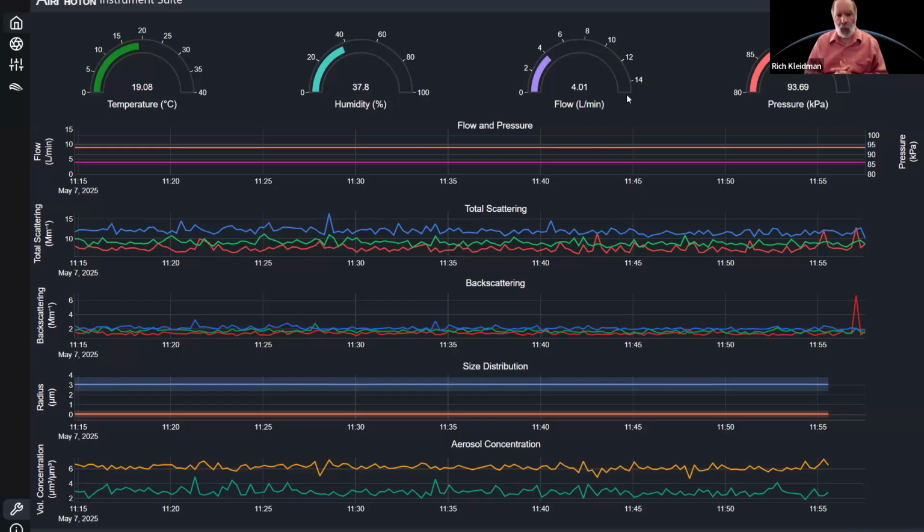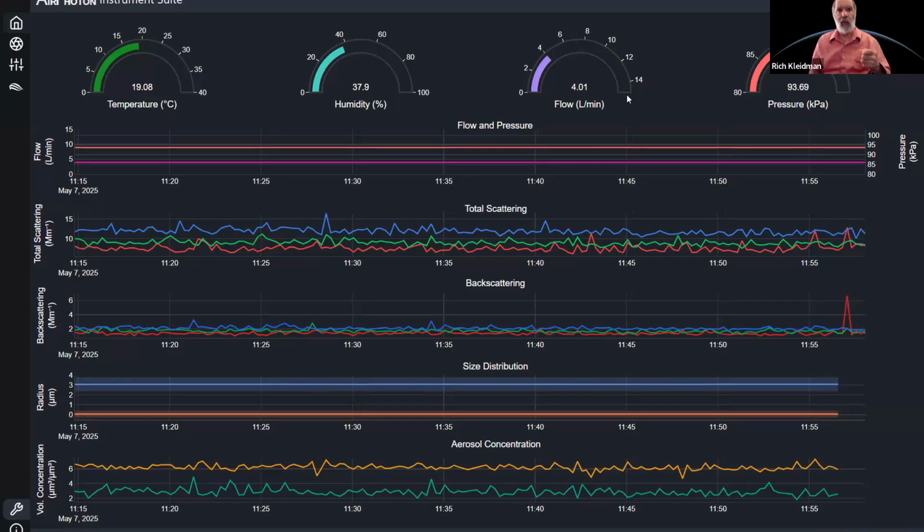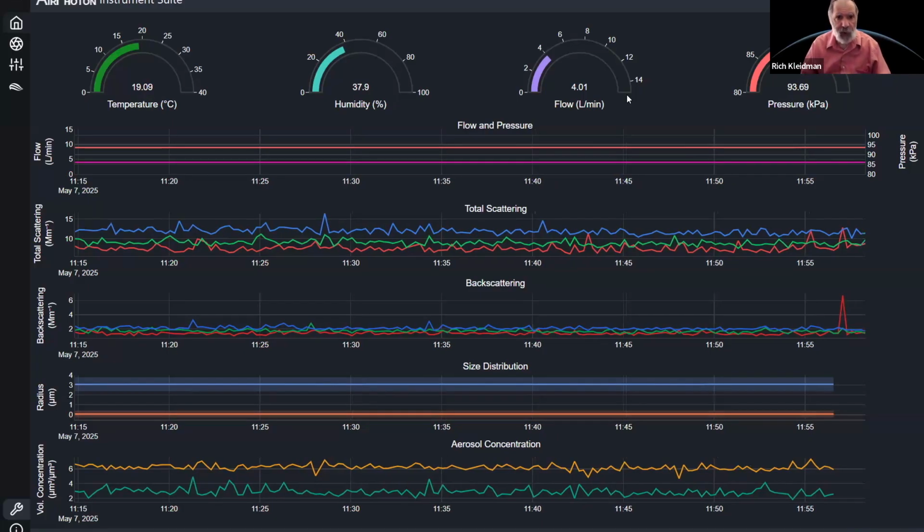And also, not all of the nephelometers are able to do multiple sizes, but we're working on a capability to retrieve the size distribution or a calculation of size distribution, even just from a single flow rate where we're only measuring, say, something like PM 2.5. So that's some of the things that Fernando was referring to.